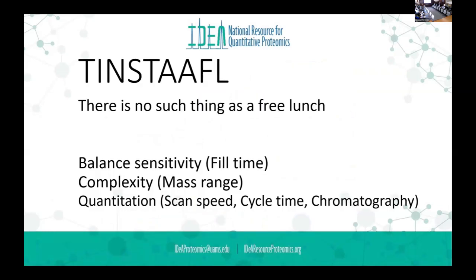So I come back to TINSTAAFL. It's really balancing the sensitivity or the fill time of your instrument, the complexity or the mass range. Is the Astral fast enough that it can do a 2 Thompson window? I might argue it may not need to. If you want to run the fastest gradients, I think you can't do that. But you can run a 4 Thompson window and probably get really close.